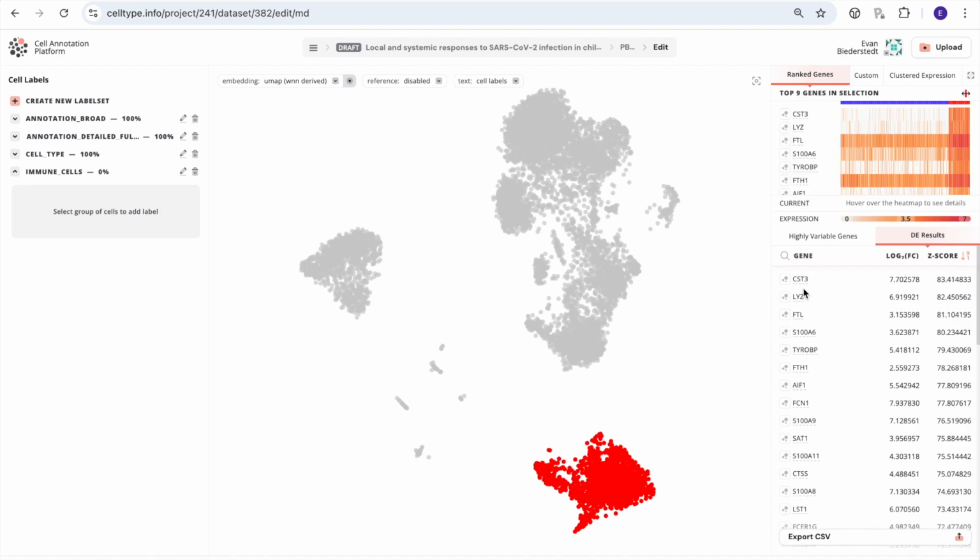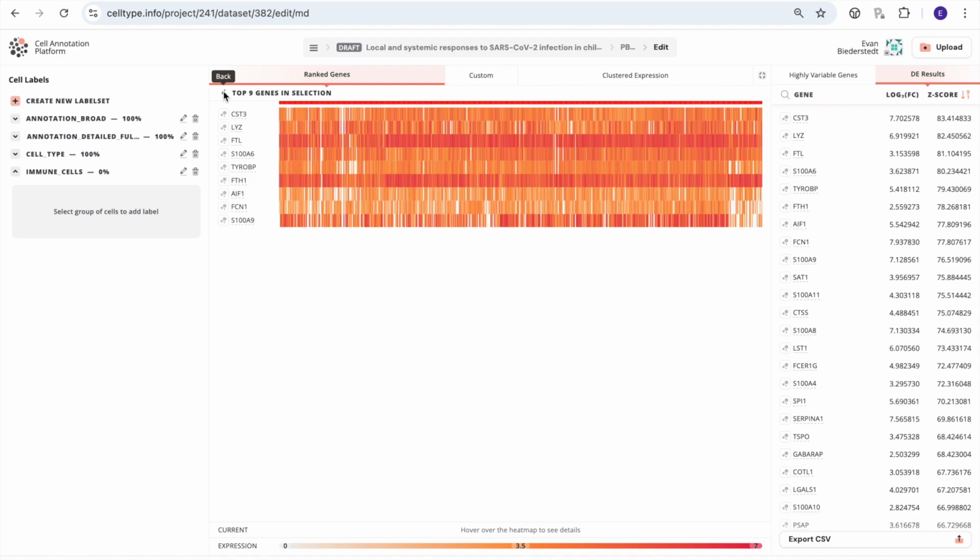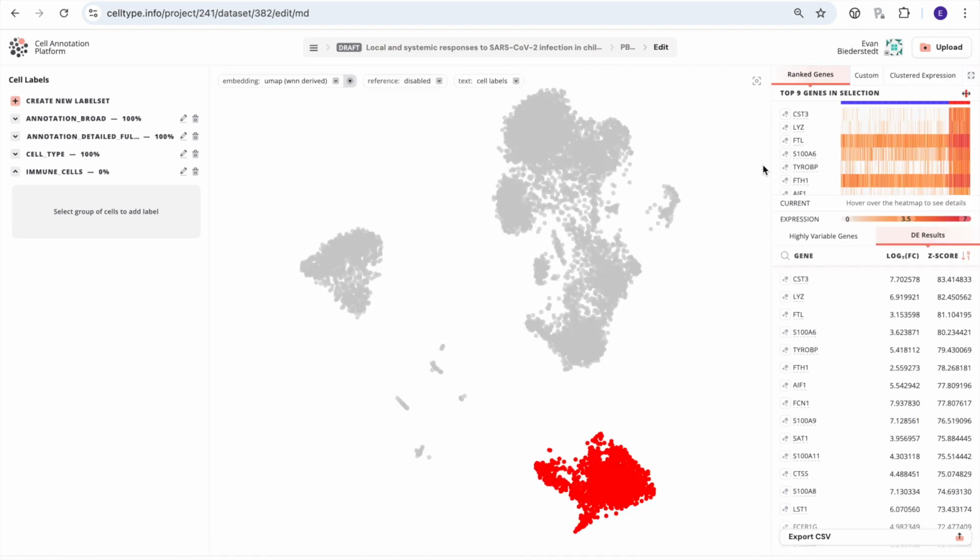And sure enough, we can see the results here that are loaded. We could look at a heat map to show what is special about these selected cells in red versus the others. I could zoom in if one needed to see really those specific cells, what are the gene expression patterns. But we could go back, and I happen to know some of these genes, and so PBMCs are often used within the field for tutorials within single cell analysis, and we have a lot of sort of priors regarding what some of these cell types could be.